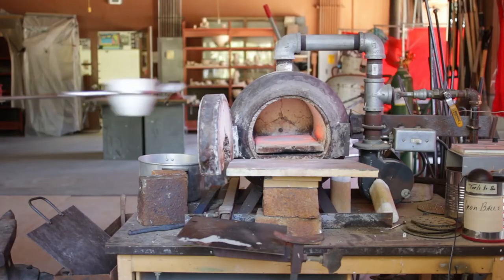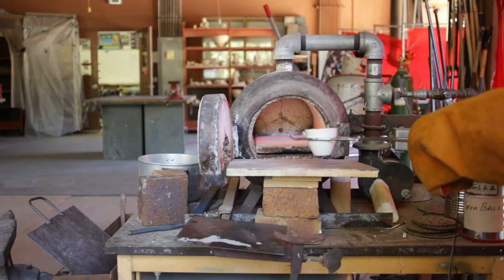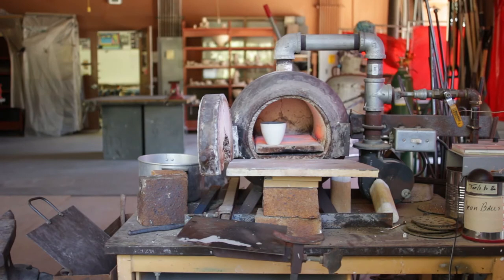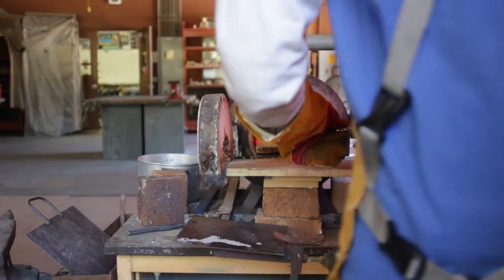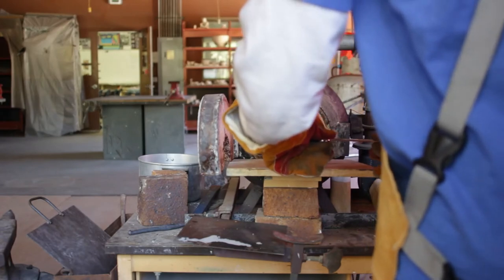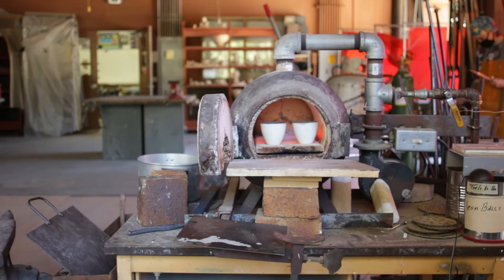I would again mix the reagents together, grinding for a couple of minutes, then load the crucibles into the furnace — this time with conditions optimized for maintaining a lower temperature and an oxidizing atmosphere — and leave the crucibles in there for two hours. Under these conditions the reaction mixture readily catches fire, which I thought was fun to watch as long as I had my respirator on.